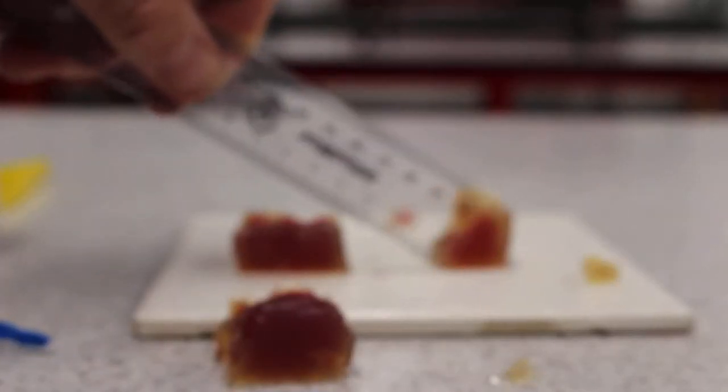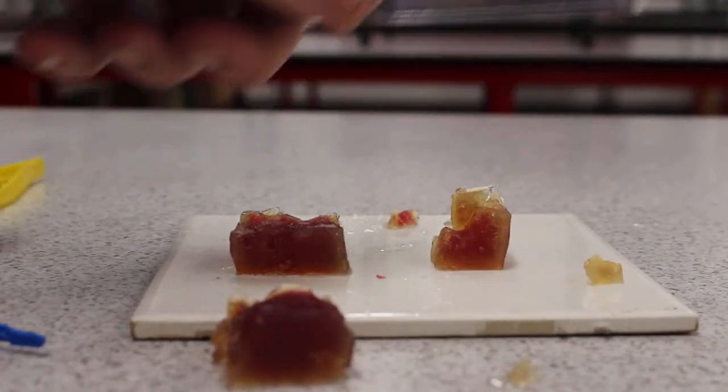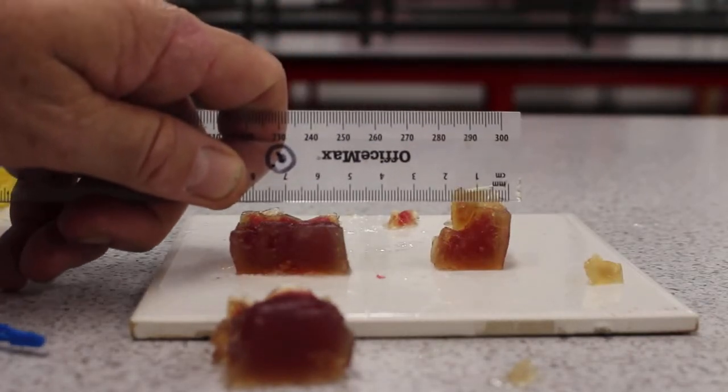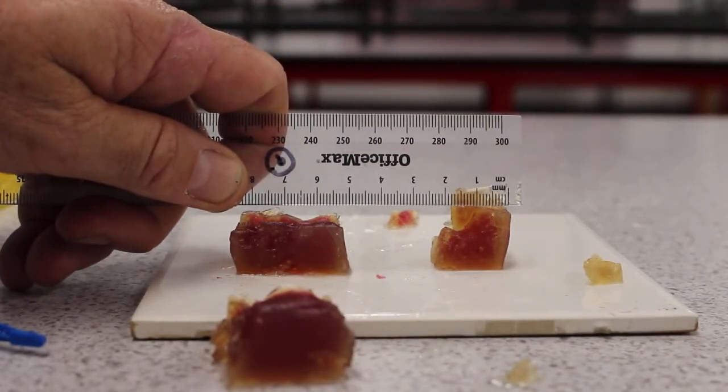With the larger cubes, you need to cut those in half and measure how far through the acid has diffused.